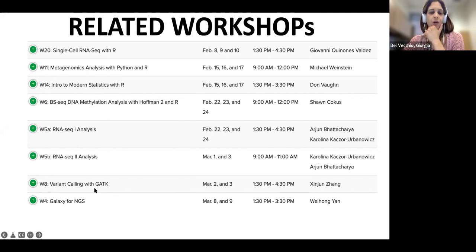Or the variant calling. So as you saw during this workshop, there are so many different library preps you can perform, and at the same time there are the same amount of different analyses you can perform.